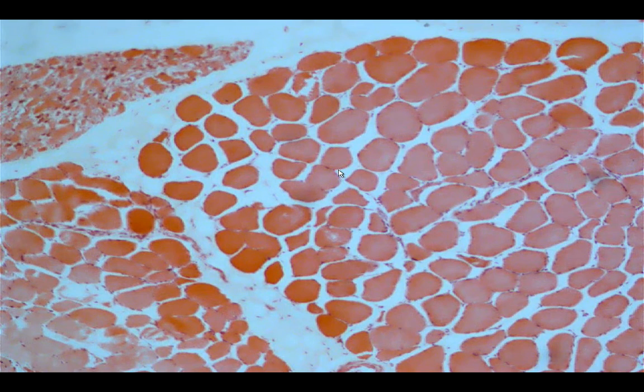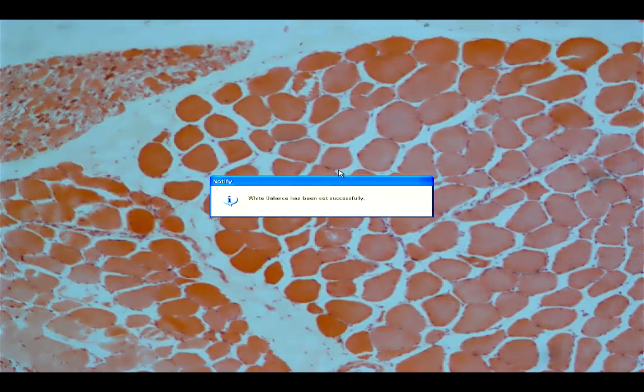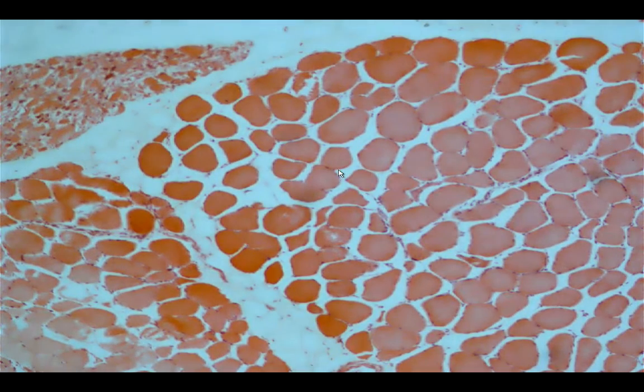So now let's talk about the skeletal muscle. The skeletal muscle is a striated muscle. There are two types of striated muscle. We have the cardiac muscle and then we have the skeletal muscle. So it's very important that in the practical exam, you have to specify your particular answer as either skeletal or cardiac. Again, you have to specify it and do not simply write there, it's a striated muscle.